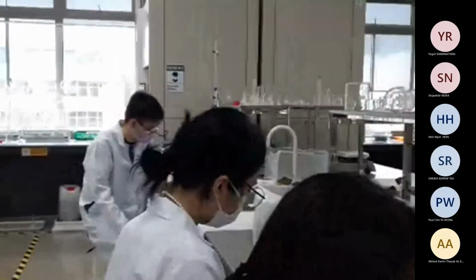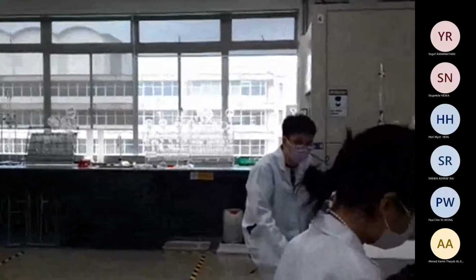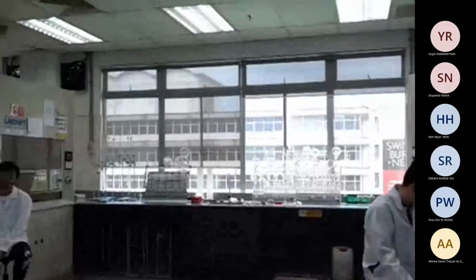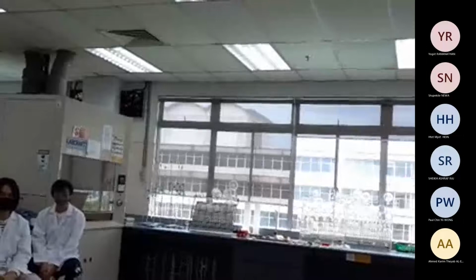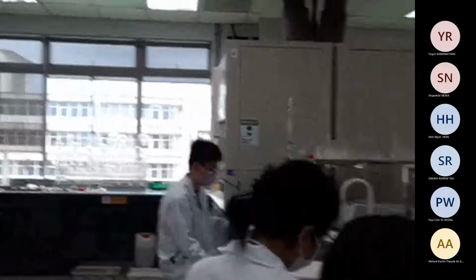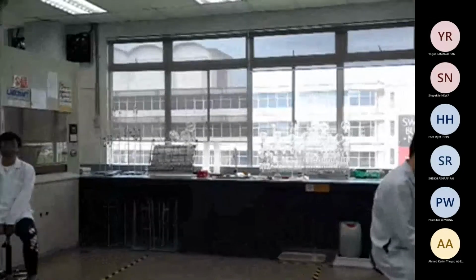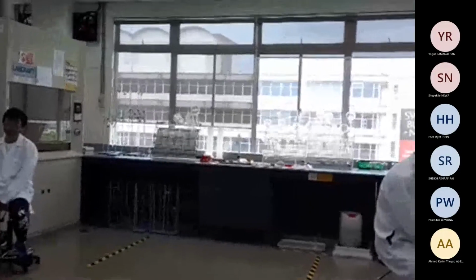But one thing is, if you make a little mistake for one of these standards, like for 10, you will take 0, 5, 10, 15, 20, and any of them you slipped a bit. For 15, let's say in the middle, you take 14.9 or 15.1. How much will it impact your result? Can you just predict? I know that you don't know it, but I ask you to just predict or think how much it will impact your finding the unknown. How much? What do you think?